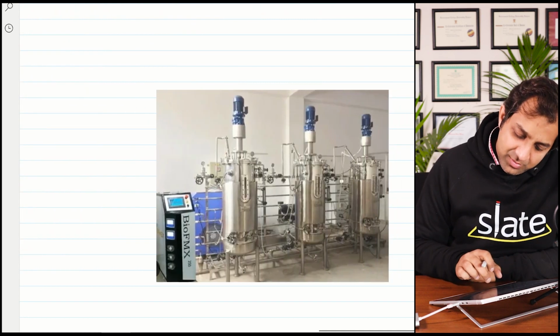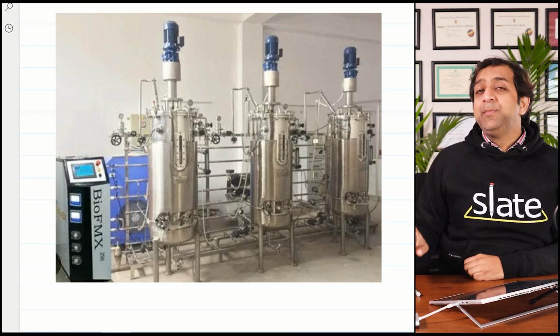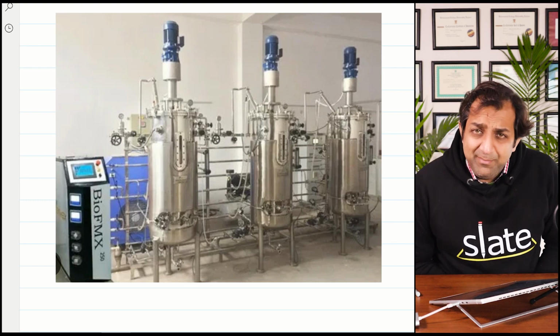Now let me show you a picture of an industrial fermenter. Look at it. These are pilot scale but industrial fermenters. So they are quite complex. They have involved a lot of research and development.